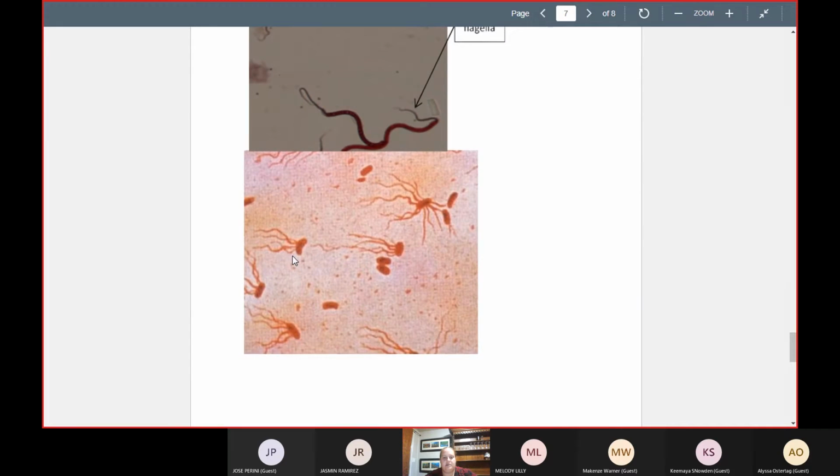And the reason is these bacteria are actually using a process known as chemotaxis. So chemotaxis is how bacteria move towards food sources. They can sense the chemical signature of something, and by sensing that chemical signature, they either move towards it or away from it. So these bacteria, the bottom 4 bacteria, are all actually moving towards something.